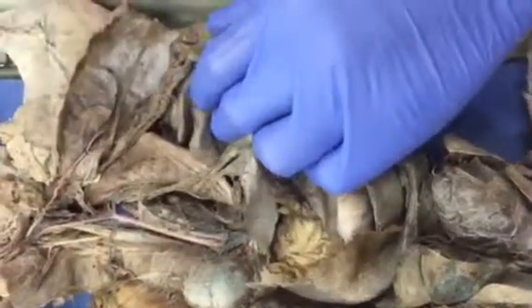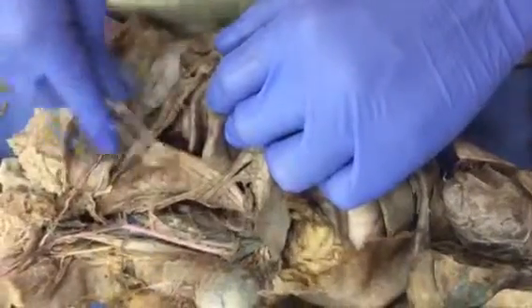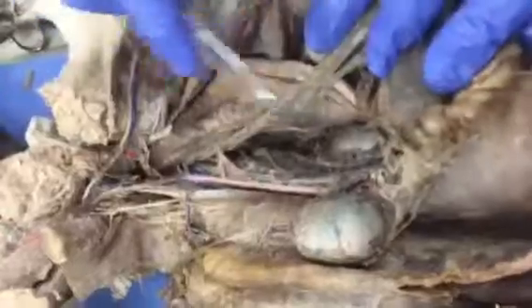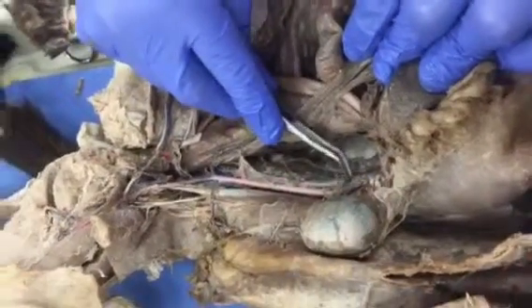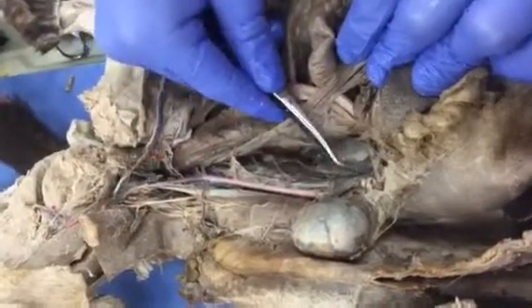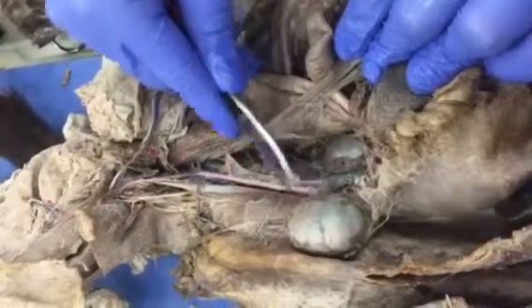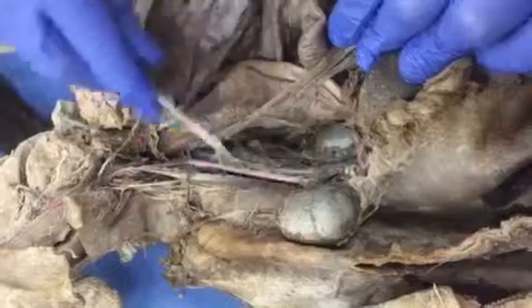You have your ascending, your transverse, and then your descending colon, right? And if we look at the vasculature caudal to the heart, this is your inferior vena cava, which is extending into the renal arteries and veins.